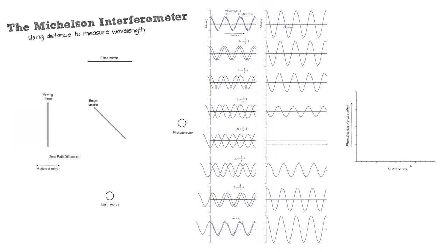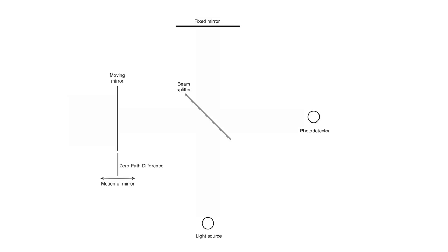All right, so let's discuss an interferometer and its effect on light power hitting the detector. Let's zoom in on the important part here. Here's a highly simplified diagram of an interferometer. Imagine that you have a light source. And this light source, obviously in an IR, is designed to emit light that includes the IR frequencies that we're interested in. And that light is going to encounter this beam splitter here. So the light is going to leave the source, and it's going to hit this beam splitter.